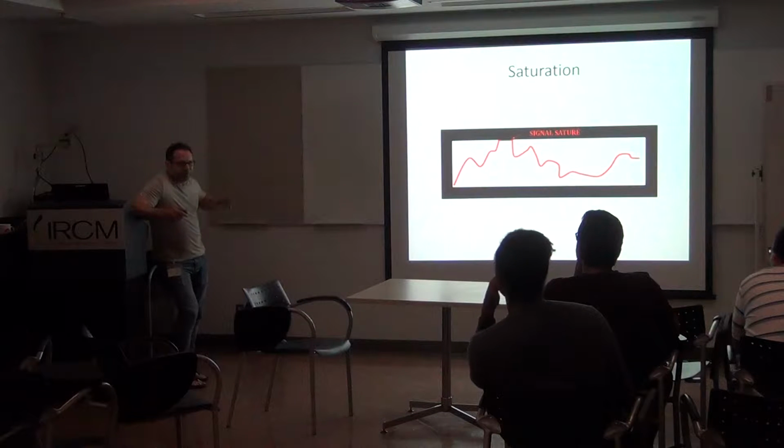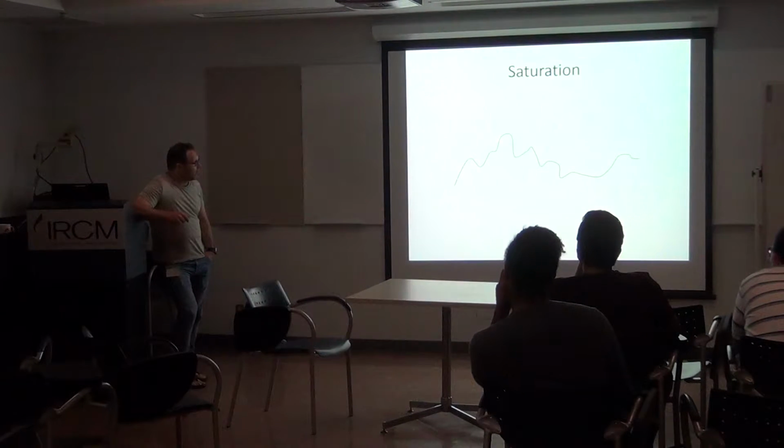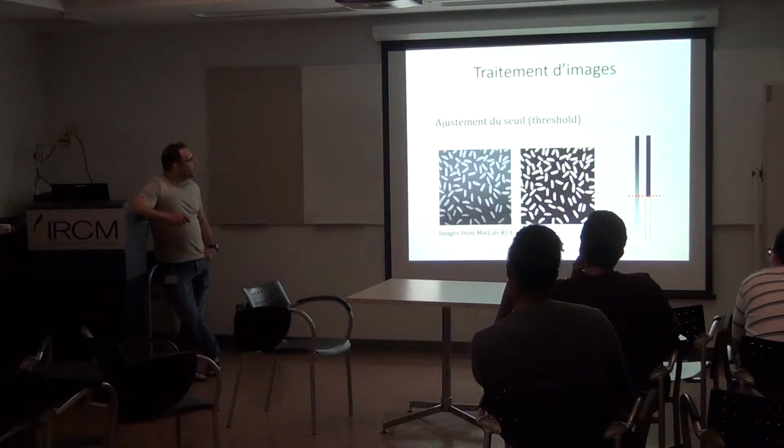They do have a maximum that they are able to collect, and so with the camera you get sometimes saturation, and you will try to avoid that, because if you want to measure, and let's say if you want to see the curve here, then if you only get that, you don't know if there's something that moves like this, like crazy, or if it's just smooth or anything. You can just figure out that it does that, but you don't. Okay?